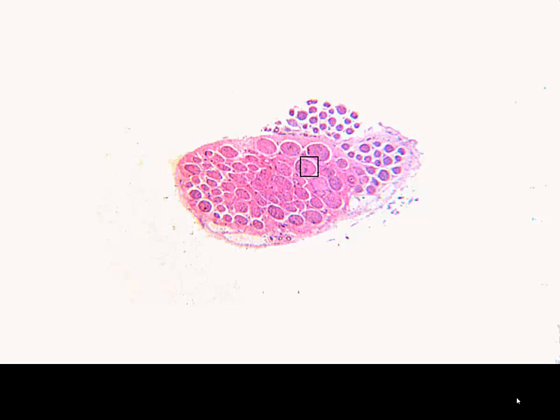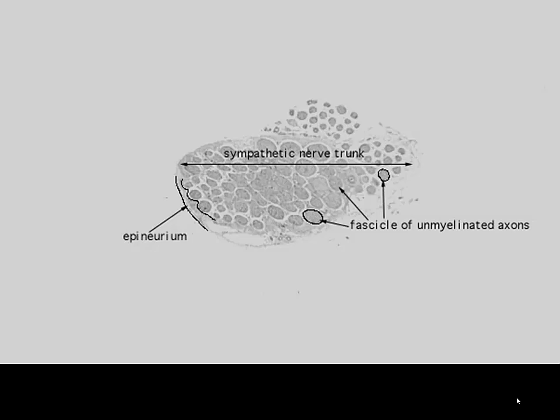This is for lab, and so we're going to look at a lot of histological images of different areas of the central nervous system, peripheral nervous system, and nerves in general throughout the body. In this first image, we're looking at a low magnification micrograph through a peripheral nerve, and you're seeing a bundle of axons, bundled together into fascicles. With this one, we're going to look at higher and higher magnification as we go down, but basically what we're seeing is the epineurium that surrounds this entire nerve, and then the bundles of axons that are present within each.